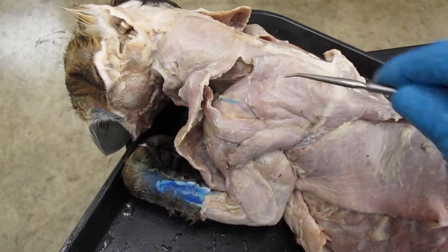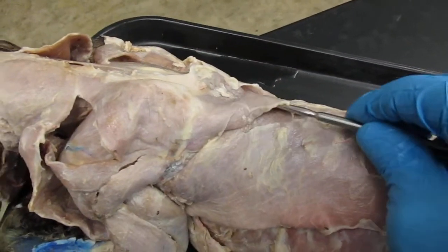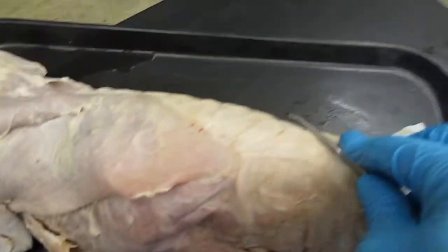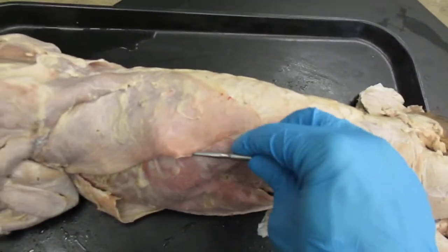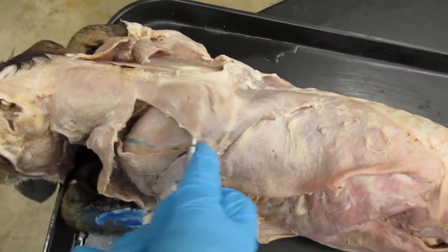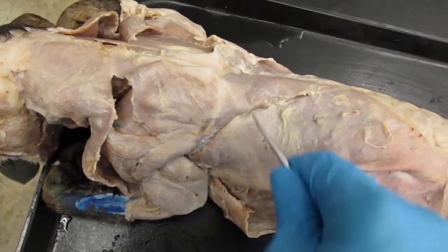Clavotrapezius, acromotrapezius right here, and spinal trapezius right here. This big muscle right here is your latissimus dorsi. This is latissimus dorsi, and this structure right here is your lumbodorsal fascia. Latissimus dorsi, spinal trapezius right here, and then your acromial trapezius, and then the clavotrapezius. So clavotrapezius, acromial trapezius, and spinal trapezius.